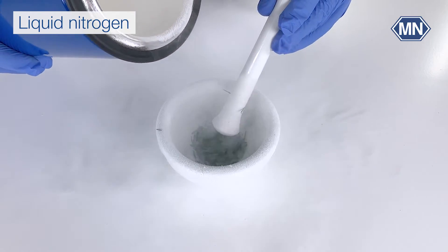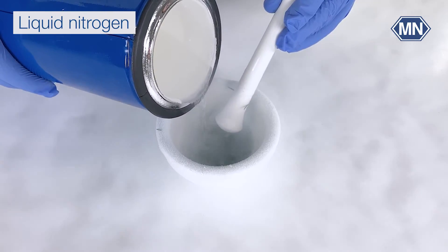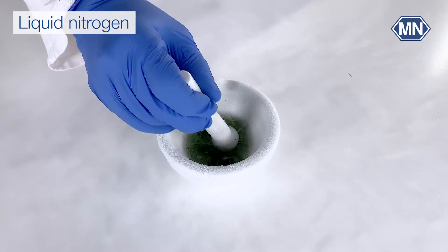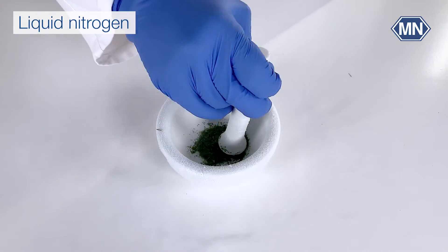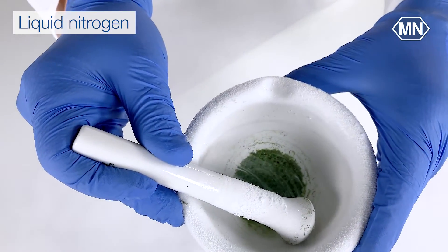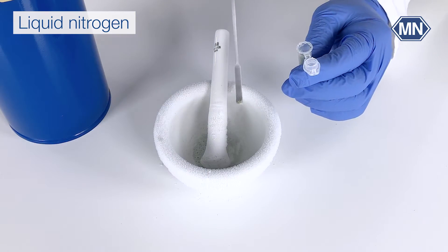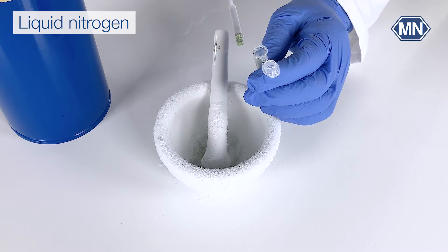Periodically check the sample's consistency to ensure it's properly homogenized. Depending on the sample type, this process may take some time. Once the sample is adequately homogenized, transfer it to a container suitable for further processing, such as a microcentrifuge tube.